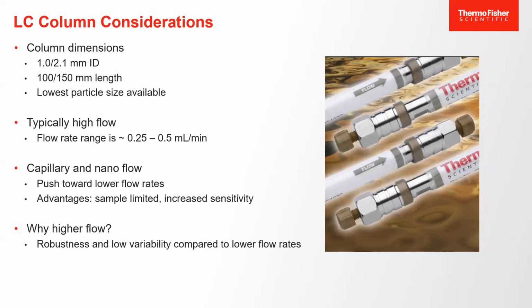But a lot of it's going to depend on the flow rate of your LC and the pressure that your LC can withstand. You don't particularly need a column that goes up to 15,000 PSI if your HPLC doesn't even go that high. It's great if your column can outdo your HPLC, but that doesn't require you to have an HPLC like that. We also have our capillary and nanoflow. Jin's lab has how many nanoflow systems? 5 nanosystems. So he's not going to put an analytical column on something that needs low flow rates. So that's also going to narrow down what kind of column chemistries you're going to look at as well.